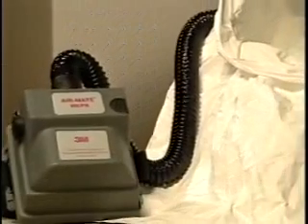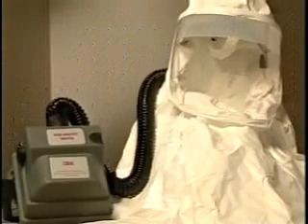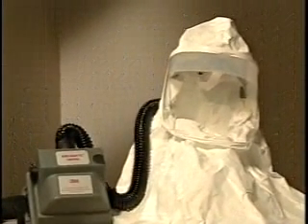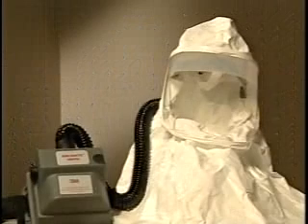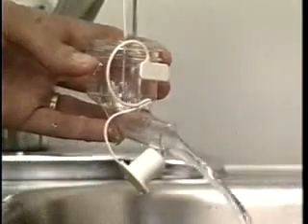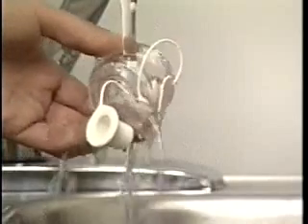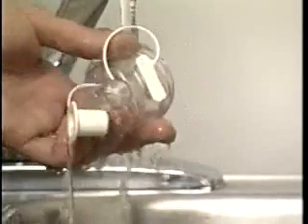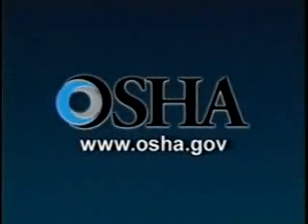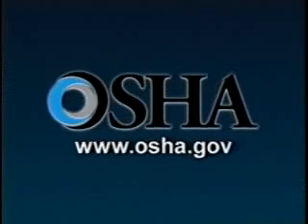PAPRs must be used in connection with an OSHA respiratory protection program that includes procedures for cleaning, disinfecting, inspecting, storing, and maintaining this equipment. Batteries must be stocked and stored. After completing the qualitative fit test, the unused solutions in the nebulizer should be discarded. Immediately rinse the nebulizer with warm water to prevent clogging. Refer to the OSHA website at www.osha.gov for the most current information about use of respirators.